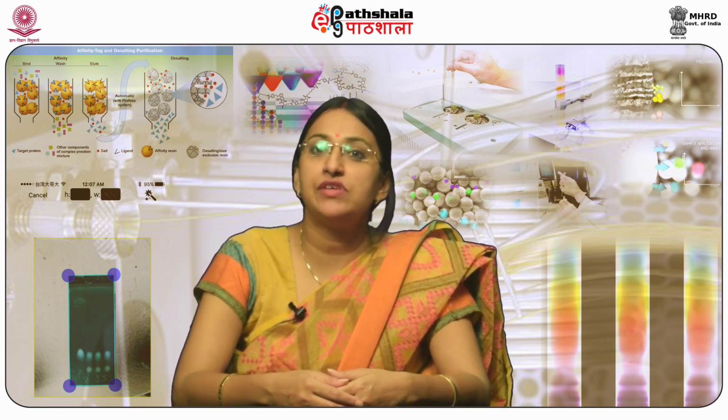Desorption of analyte molecules takes place by increasing the salt concentration in a gradient manner or altering the pH. Since the solute molecules carry charge and reversibly bind to the stationary phase by displacing the counter ions, they are eluted in the order of their strength of binding. The most weakly bound substance elutes out first and vice versa.